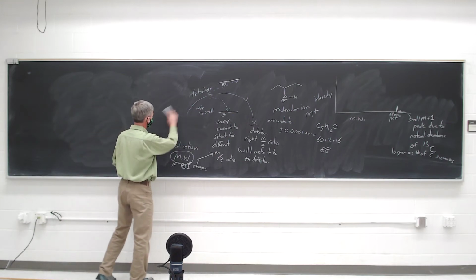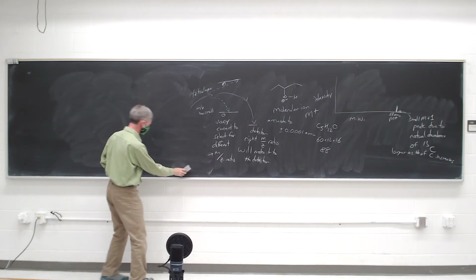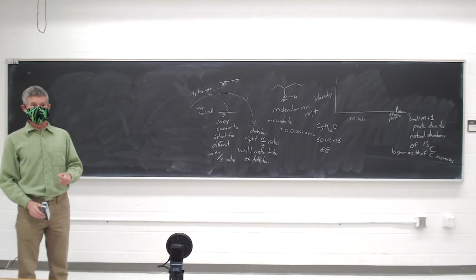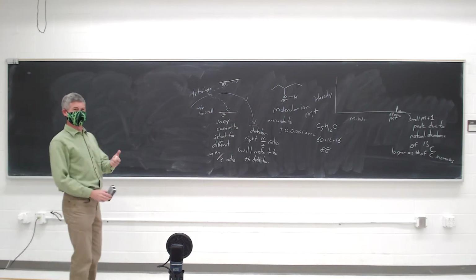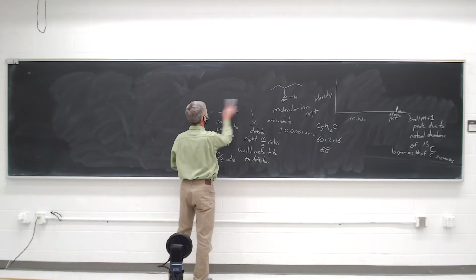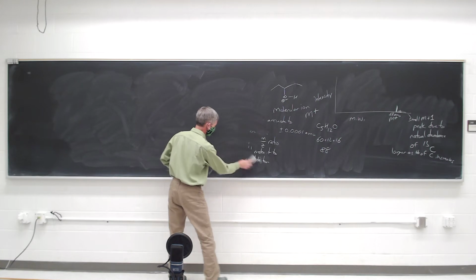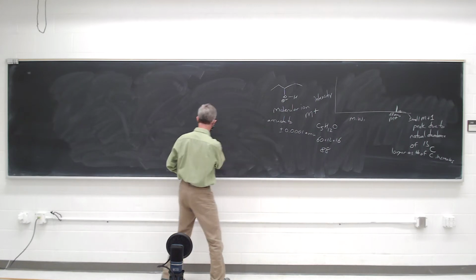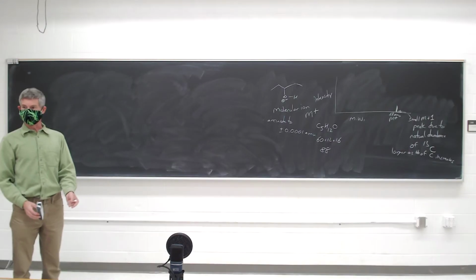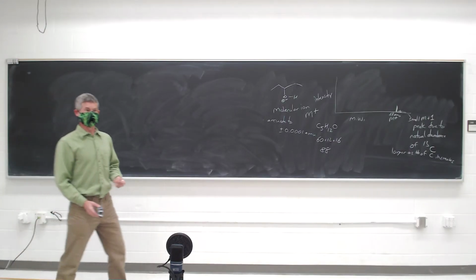If you watch CSI or NCIS or any of the crime shows, you know that a GC mass spec is one of the main pieces of equipment that tells you who did it. It doesn't really tell you who did it like it does in the shows. But the GC mass spec is really good at identifying compounds, especially if the compounds are in the library. So you can tell the difference between cocaine, heroin, and powdered sugar really quickly and easily with a GC mass spec.